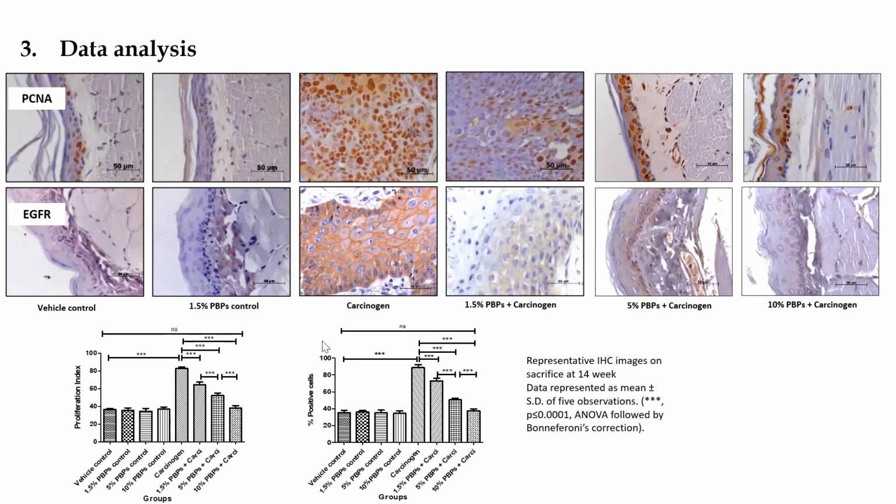Yes. So this is the graph for IHC. The graph would be different for Western. Correct? Correct, because the technique is different. And in IHC and Western also, there are differences. In IHC, you are taking a tissue slice, one random tissue slice from an entire tissue. In case of Western, this is not the case. In Western, you are taking the entire tissue homogenate. So again, the level of protein markers will differ.